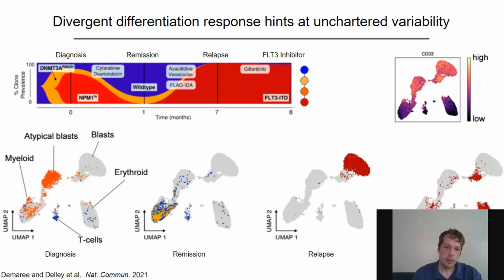However, they are also distributed throughout other blast compartments on the top right, and especially also through more healthy immune signatures. And so that's very much different from what we saw in the first patient, because in this case, we have basically no correspondence between the immunophenotype and the genotype of these cancer cells. And as you can imagine, uncovering a situation like that would be extremely hard if you need to do it sequentially, for example, by doing a FACS sorting and then genotyping of these cells, really highlighting the kinds of information we can gain with DAb-seq.